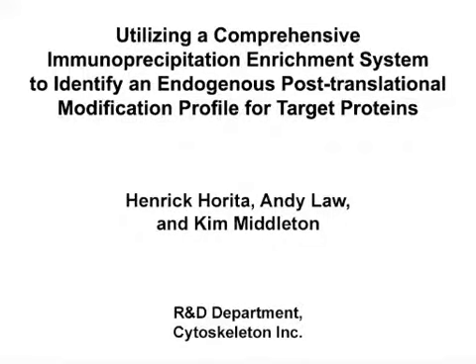The overall goal of this experimental protocol is to enable inexperienced PTM investigators to effectively determine if their target protein is endogenously modified by one or more PTMs using a single comprehensive system. This method will enhance investigation in the post-translational modification field by enabling detection of key PTMs and potential crosstalk for any target protein using a single simplified system.